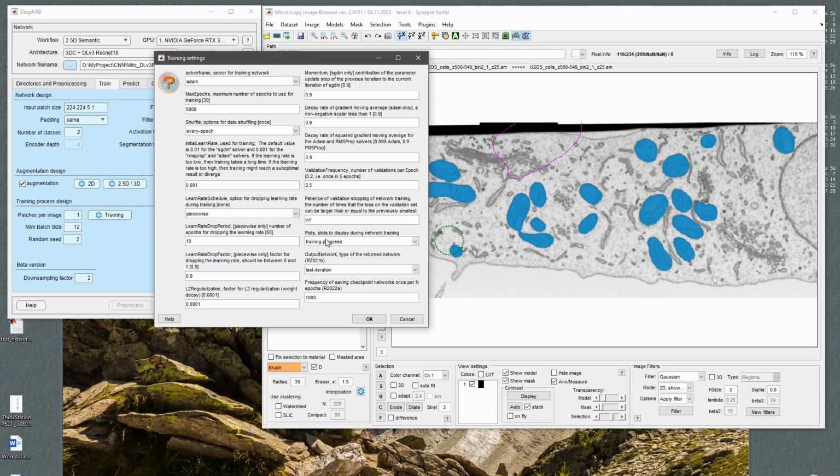epochs. The result of the training could be either the last iteration, so when the network ends, those will be the weights, or the best validation loss, when it picks the weights with the lowest score from the validation process. I will use this one now, and I will redo the pre-processing just to show you.